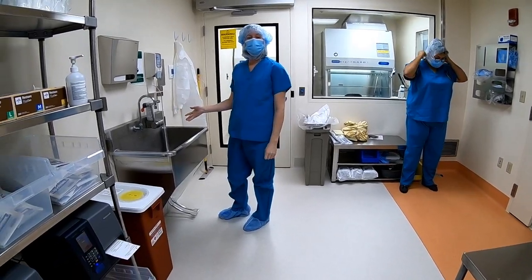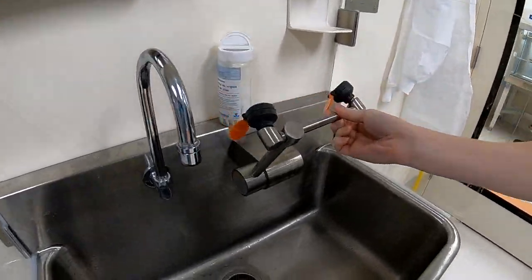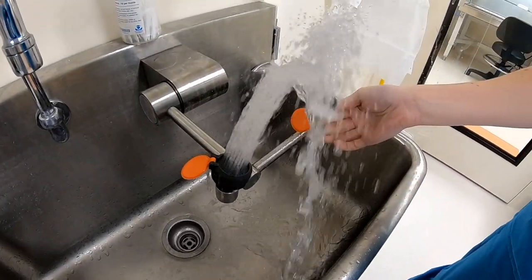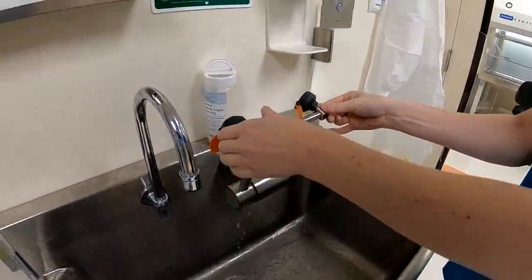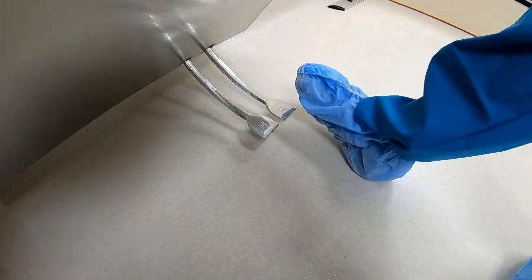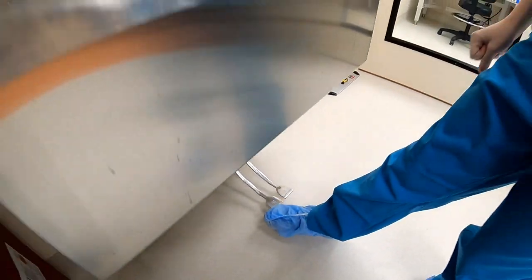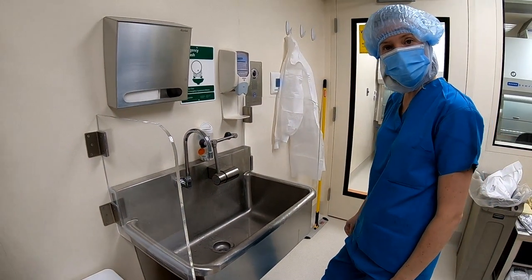Over at the eyewash station, here's how it works: it's one movement. There are hot and cold panels at the bottom — I recommend doing both at the same time. Just be aware that hot is really hot and cold is really cold.